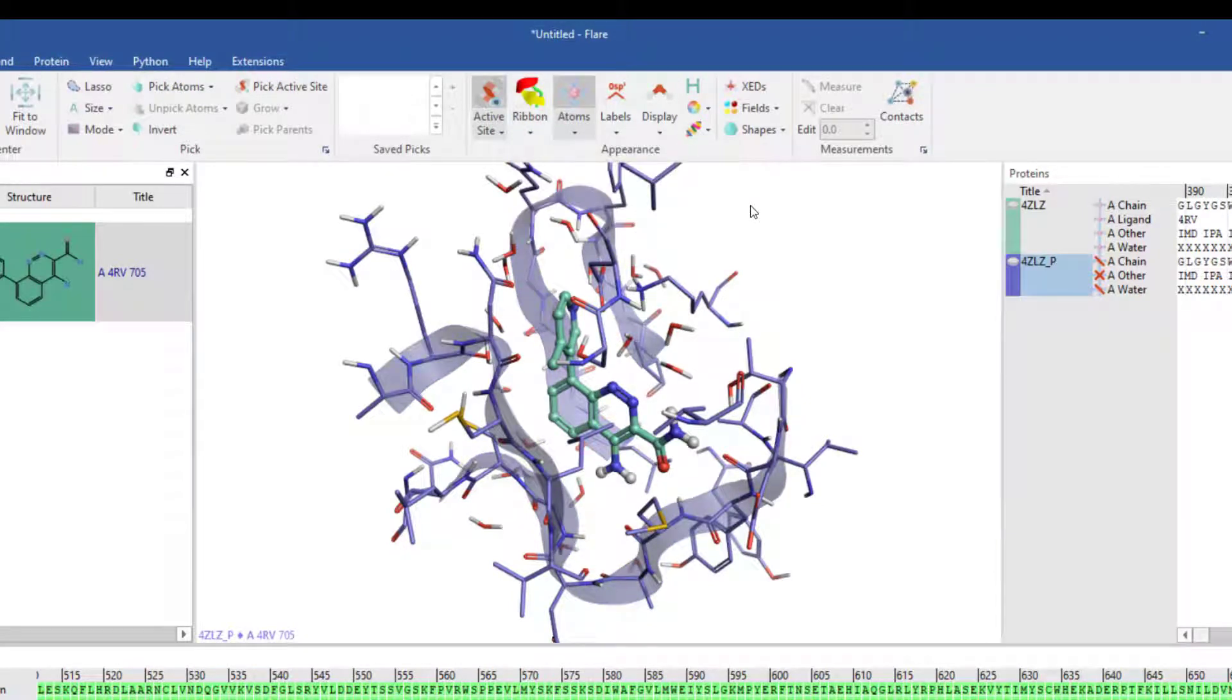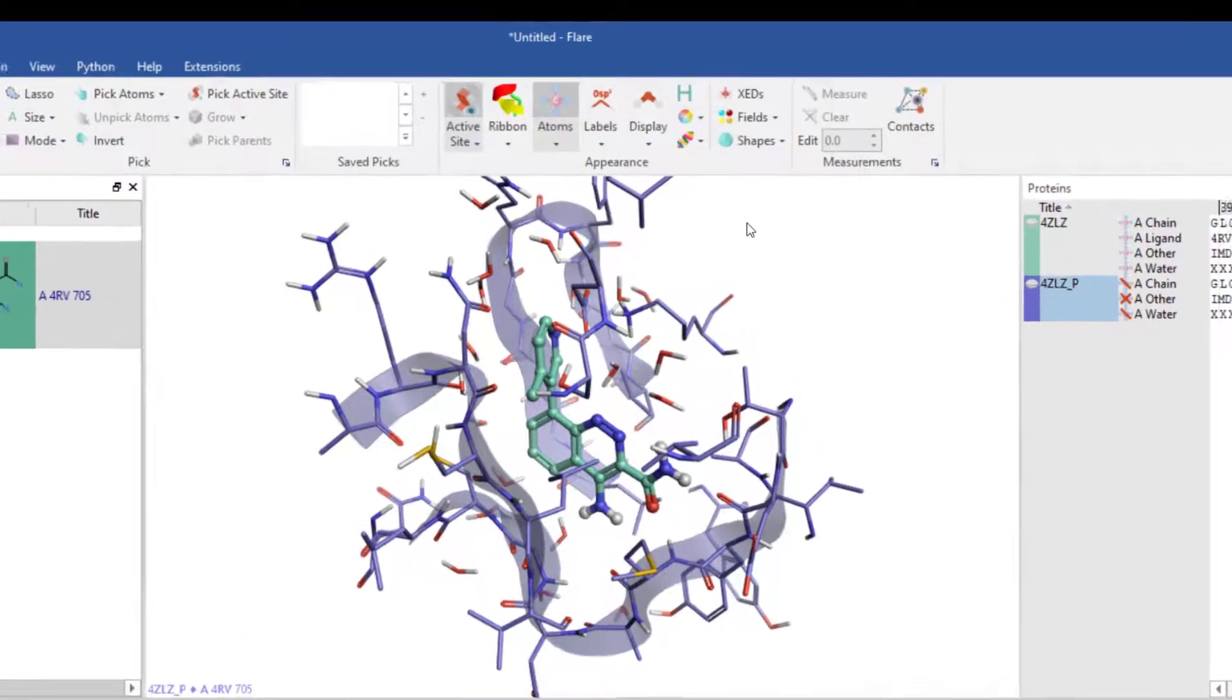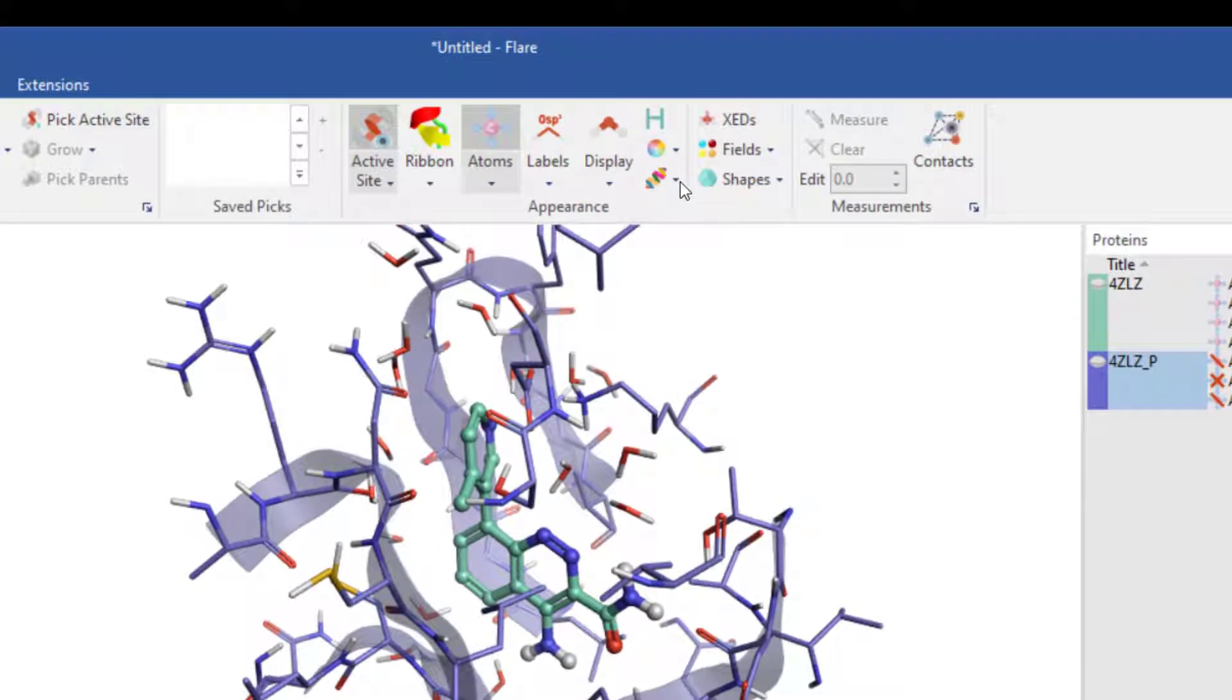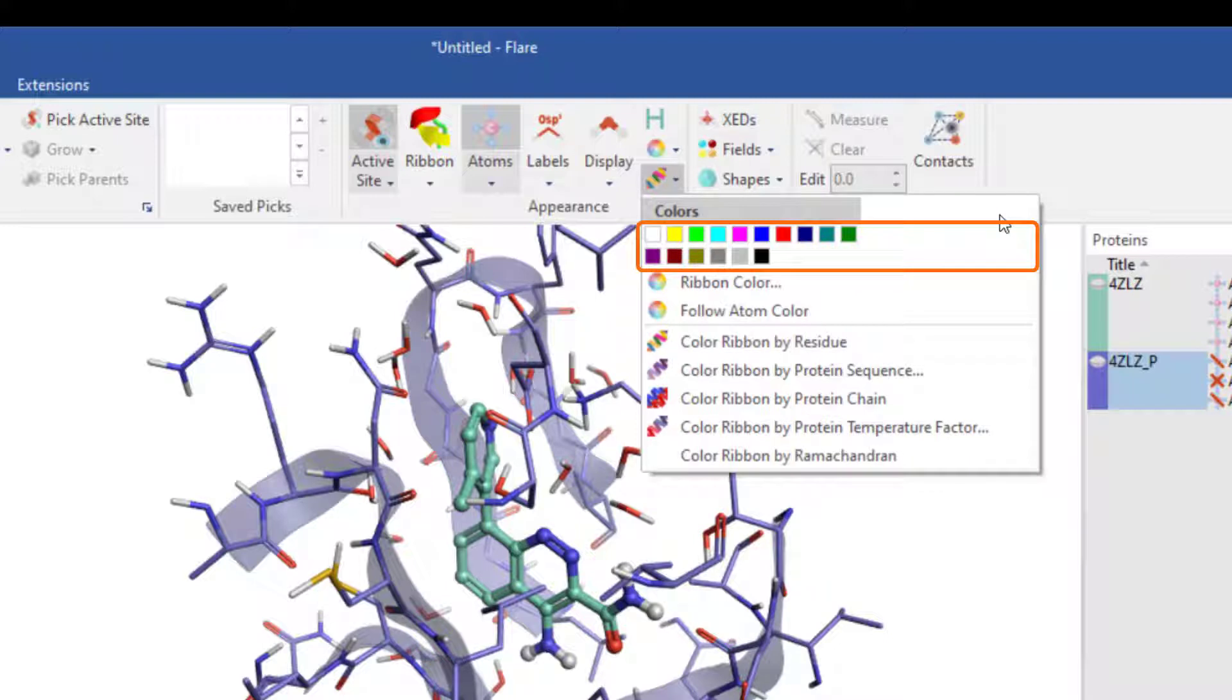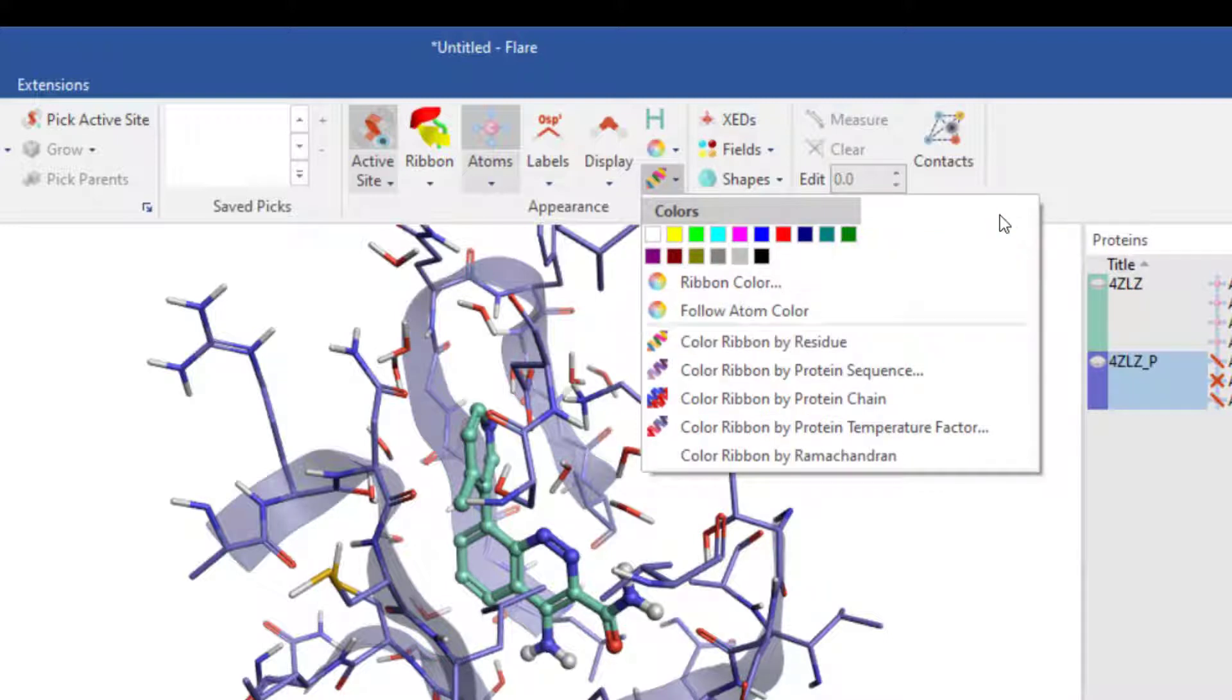Colouring options are also available for the ribbon via the ribbon colour menu. If you choose your own preferred colour or to match the protein atom colour, or select from more advanced options such as colouring by residue, sequence, chain, temperature factor or ramachandran.